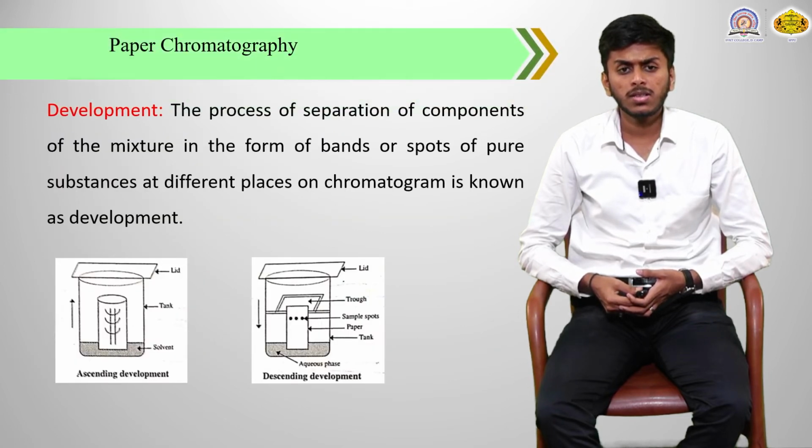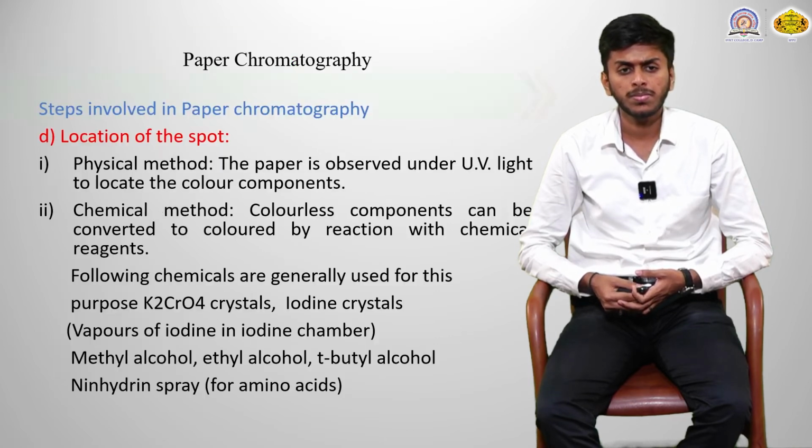The process of separation of components of a mixture in the form of bands or spots of pure substances at different places of a chromatogram is known as development of the paper chromatogram.